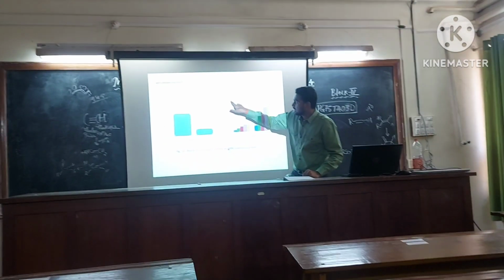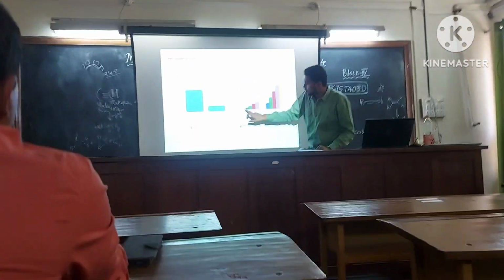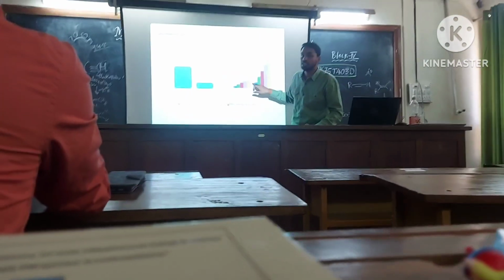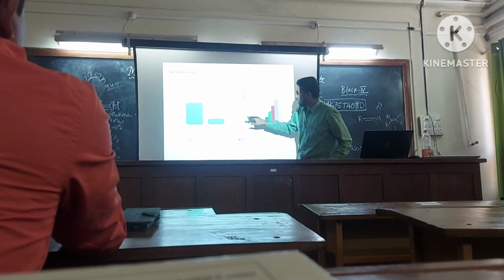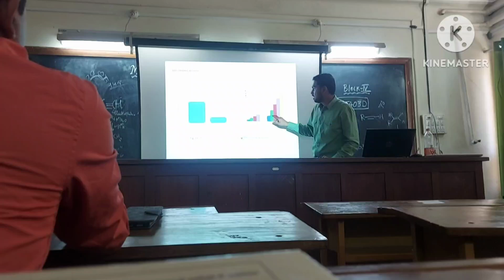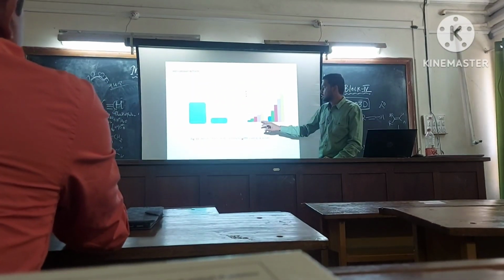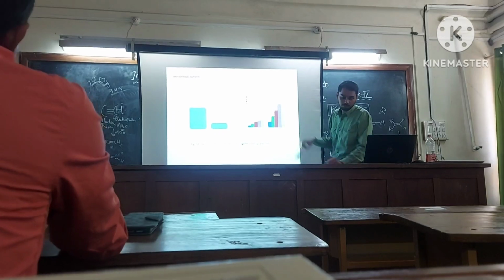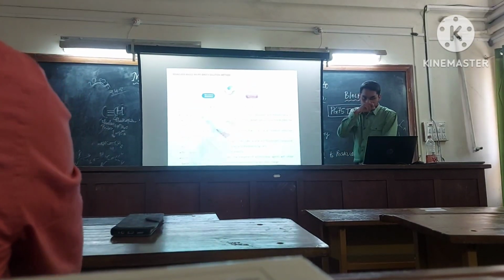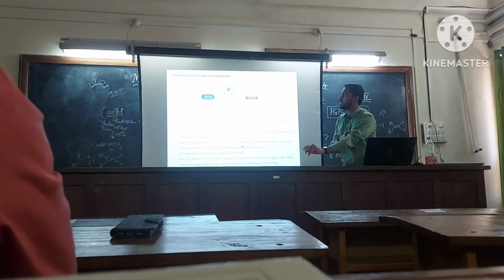Initially I took the pure compound at 10 micrograms. This was showing only 5%, while this is showing 20% of the activity, which means 4 times more potent. When I gave about 20 micrograms, PP was showing 10%, while here it is showing 30 to 35%. In a similar fashion, when I gave 50, it is showing around 90%. So this is the resazurin based microbroth dilution method.